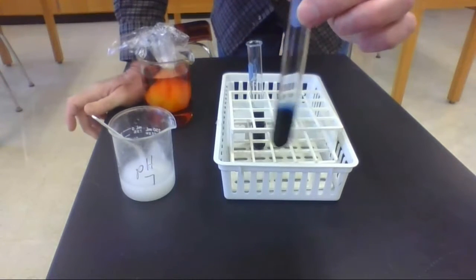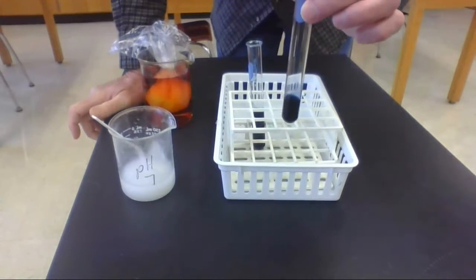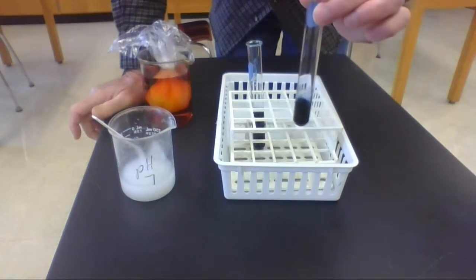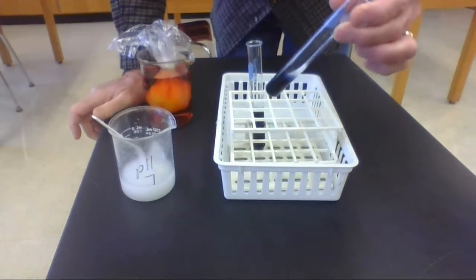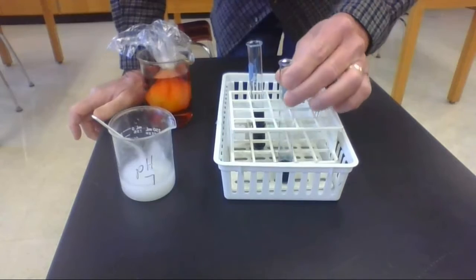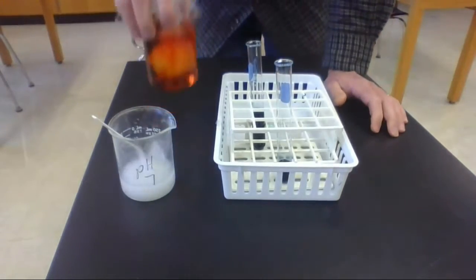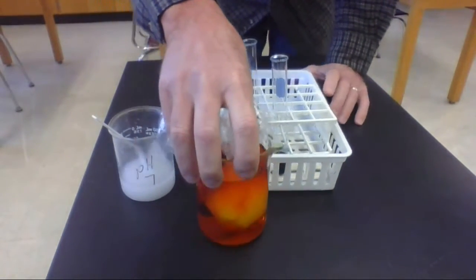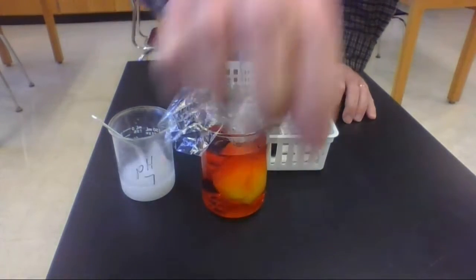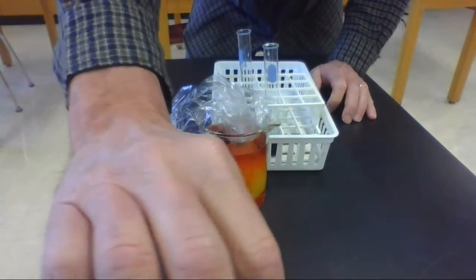So whenever starch and iodine meet each other, they actually have a chemical reaction, and the solution will turn a dark blue to almost a black color. That'll be a hint for what we see in our experiment next. See you in 24 hours.